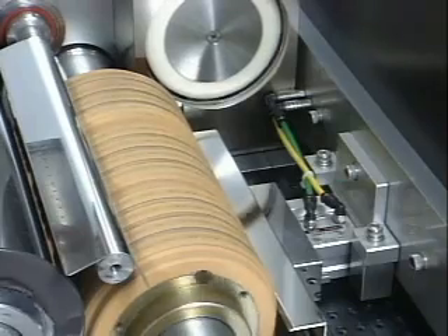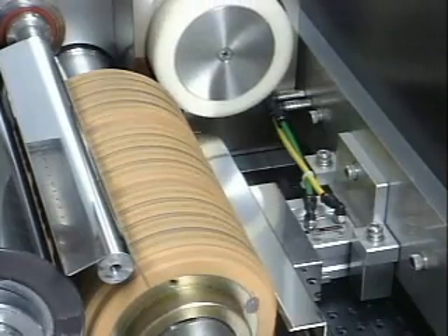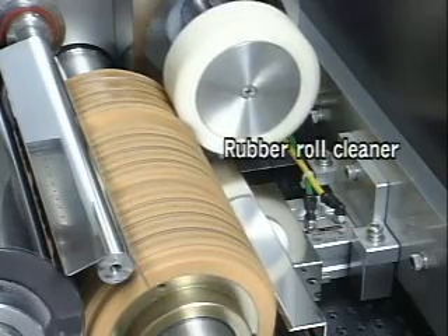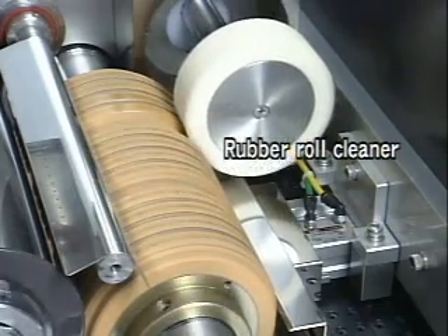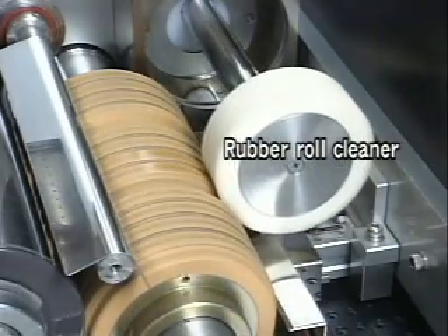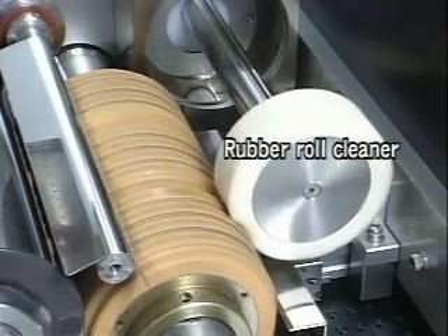Because the ink or shellac accumulates on the surface of the rubber roll, it is necessary to perform periodical cleaning. A sponge containing alcohol automatically cleans the rubber roll. Moreover, we can set a time interval for cleaning as we wish, and it is also possible to control it automatically during printing inspection.